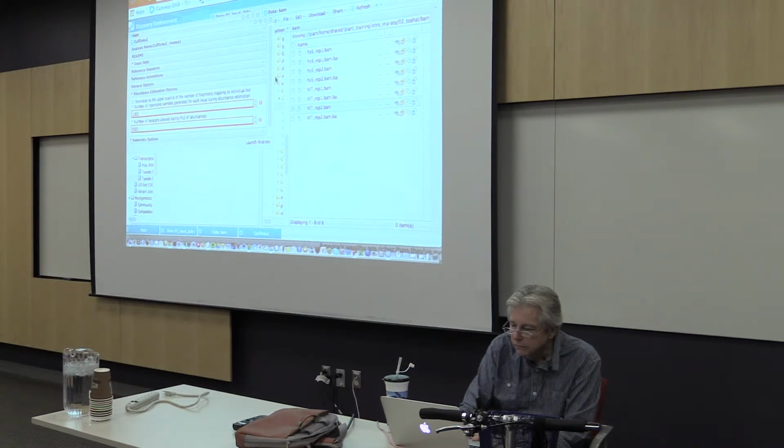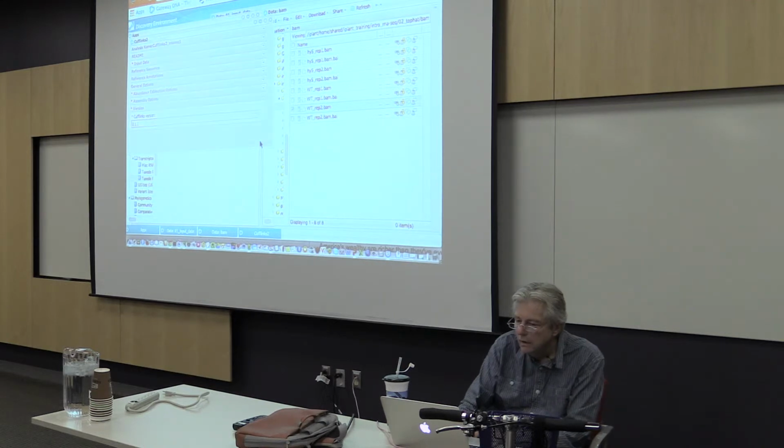I'm just going to leave these as the default. Leave it all default. And launch it.